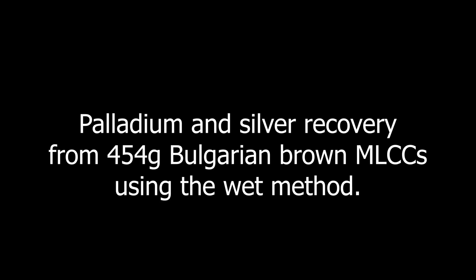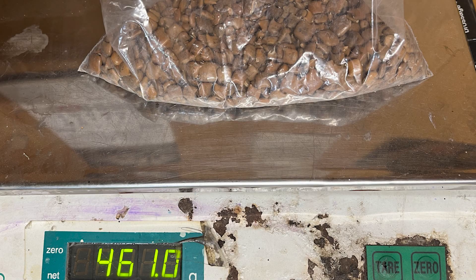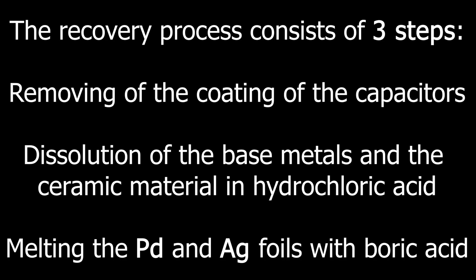Palladium and silver recovery from 454 grams Bulgarian brown MLCCs using the wet method. The recovery process consists of three steps: removing the coating of the capacitors, dissolution of the base metals and the ceramic material in hydrochloric acid, and melting the palladium and silver foils with boric acid.